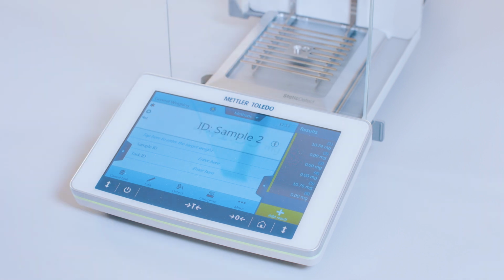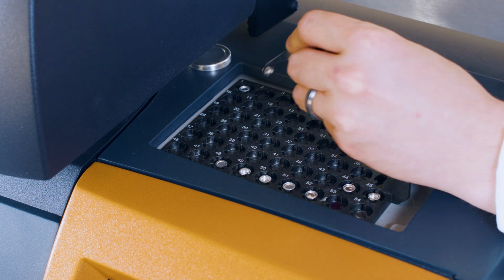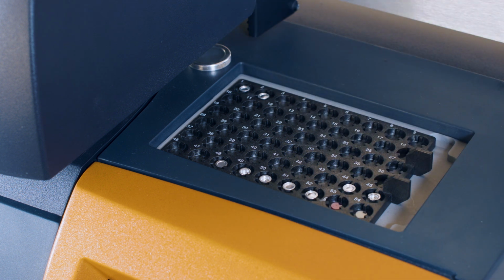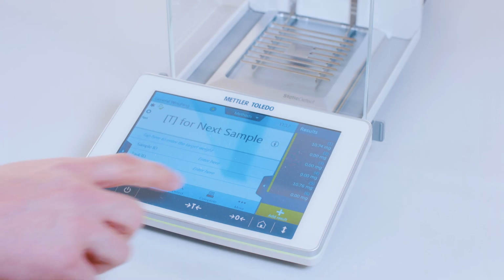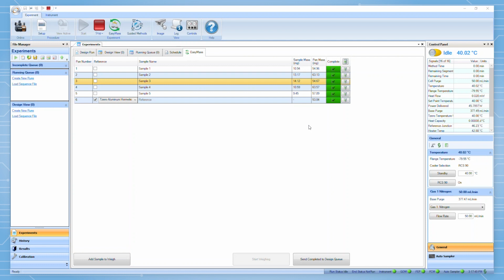Now add your sample and press Add Result again. You'll see as you do this that these masses are added to TRIOS. Set the pan in the auto sampler tray and then press Tare to begin weighing the next entry. Repeat this process for each row in the table. When you are done weighing, come back to TRIOS.